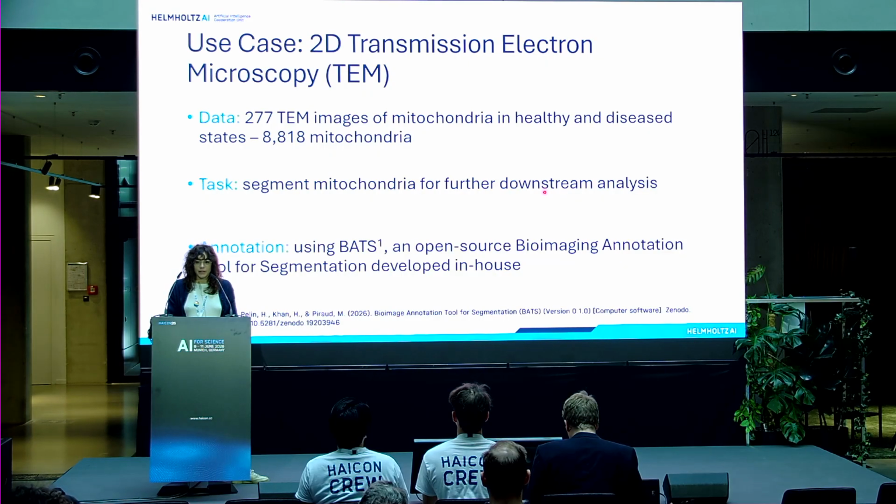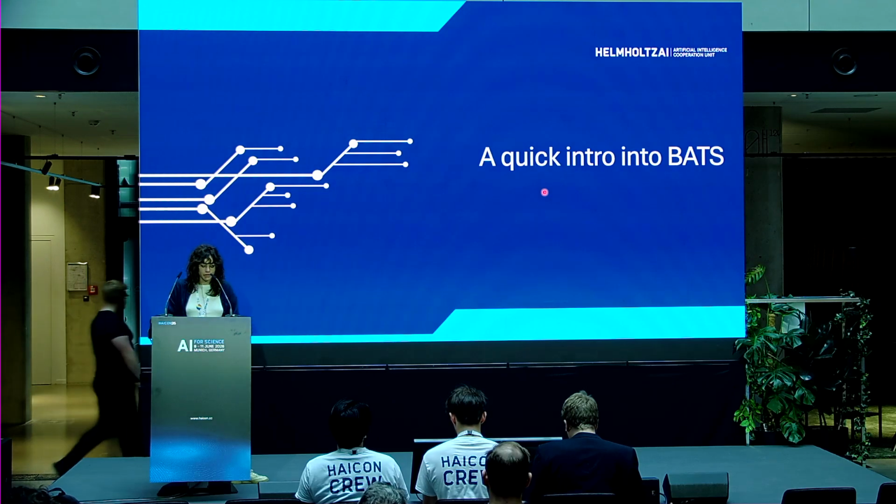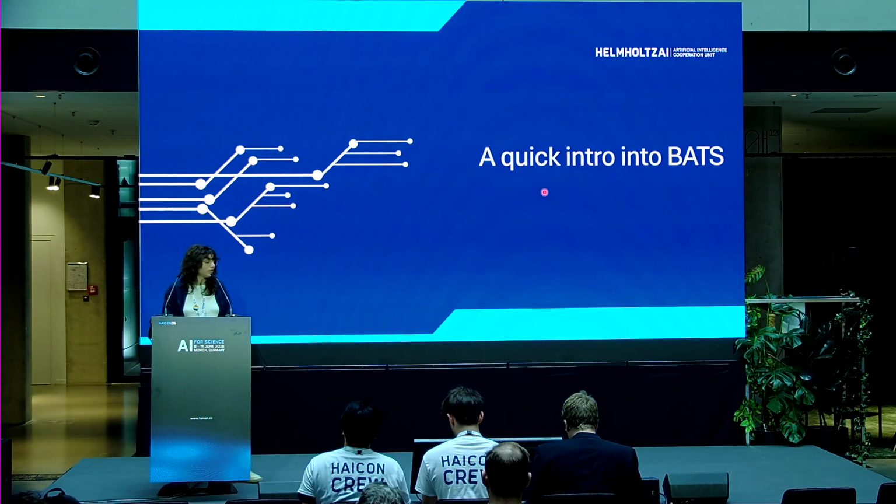And to annotate the data, we are using BATS. Now, BATS is an open source bioimaging annotation tool for segmentation, which was developed in-house in our team. And before I go into detail about what we did for this project, I want to give you a quick intro into the tool itself.